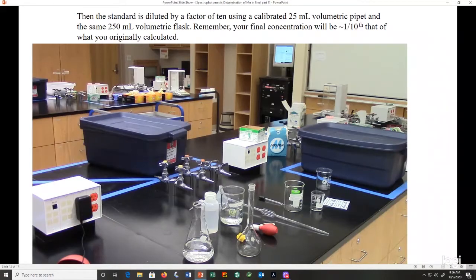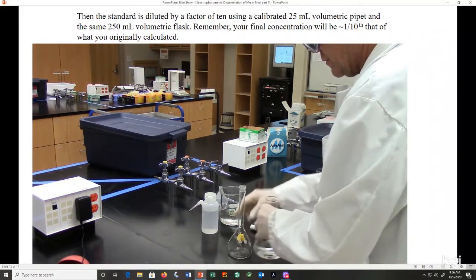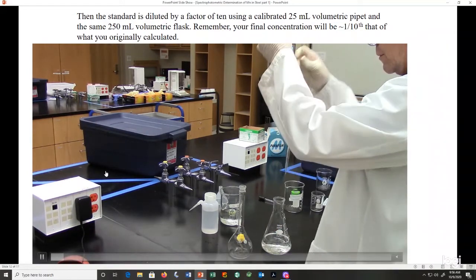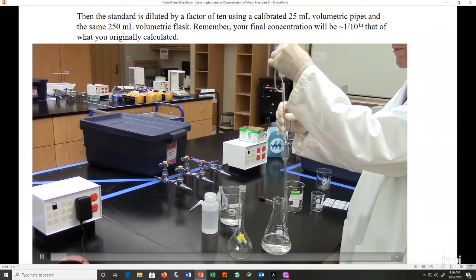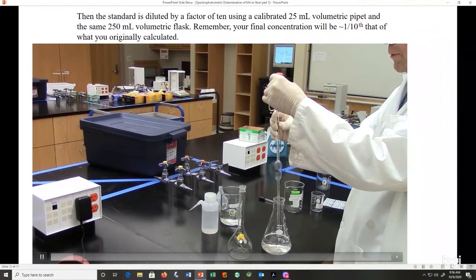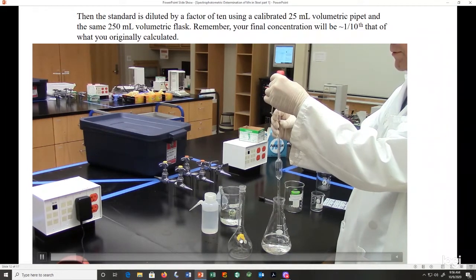Now we're going to dilute the standard by a factor of approximately 10 using a calibrated 25 milliliter volumetric pipette and the same 250 milliliter volumetric flask. Remember, your final concentration will be approximately 1/10 that of what you originally calculated. So let's assume that our calibrated 250 ml volumetric flask was rinsed out before we're going to do this dilution.